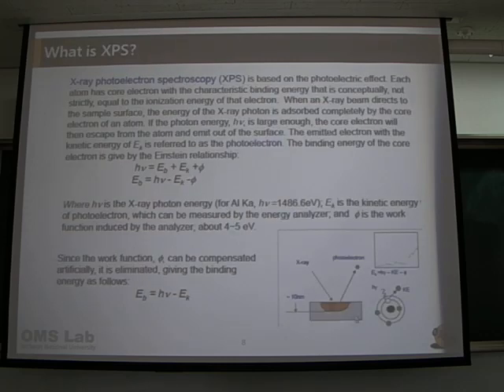I mean that this is a sample, and in this case, the photoelectron, this one is the X-ray beam. This one is the incident X-ray in this case, and this is the sample. And the sample in this case, it shows approximately 10 nanometer.